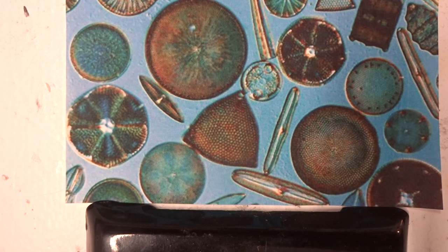Diatoms divide once a day to once every 2 weeks, producing two new daughter cells which are smaller than the parent cell. Diatoms can enlarge, however. Diatoms regain their maximum size through sexual reproduction and through the creation of a structure called an auxospore, which is a type of diatom that has silica bands called perizonia rather than a rigid silica cell wall. The perizonium allows the diatom to expand to its maximum size. Perizonium are found in the smaller sized diatoms.